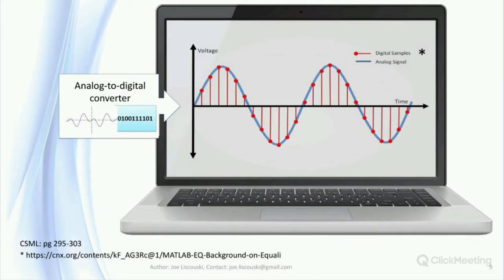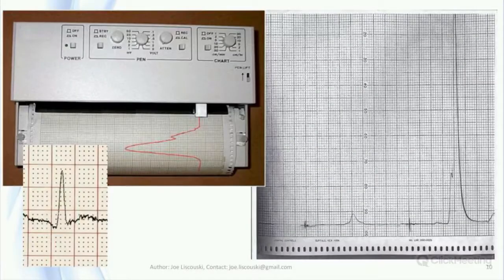The experimenter's job is to choose a set of controls that allow the digital signal to faithfully represent the incoming voltages. If either the sampling rate or the resolution of the sampling is inappropriate, the incoming data will be a distorted representation of the signal, and any subsequent use will lead to erroneous results.